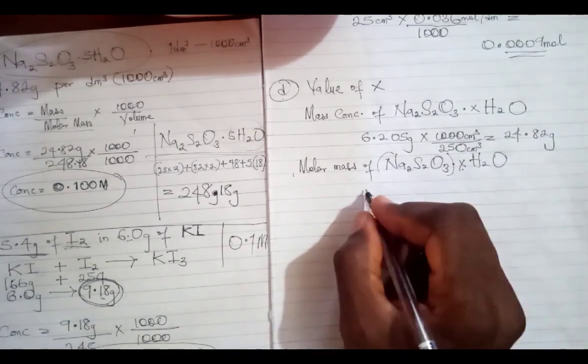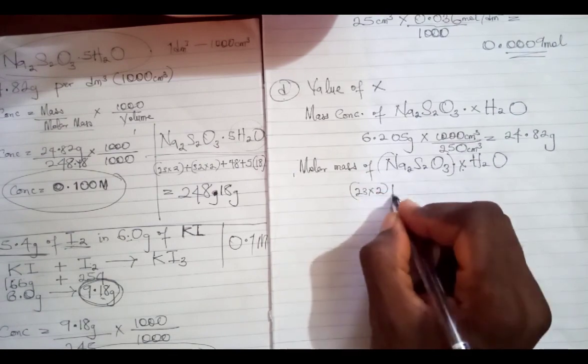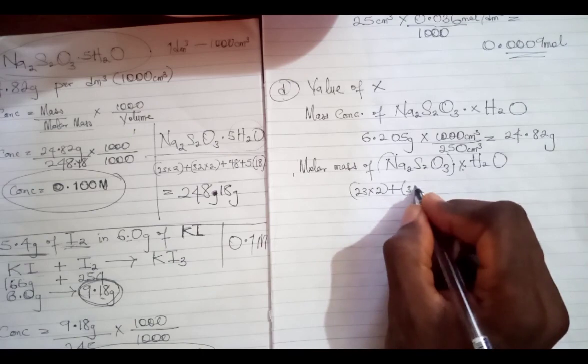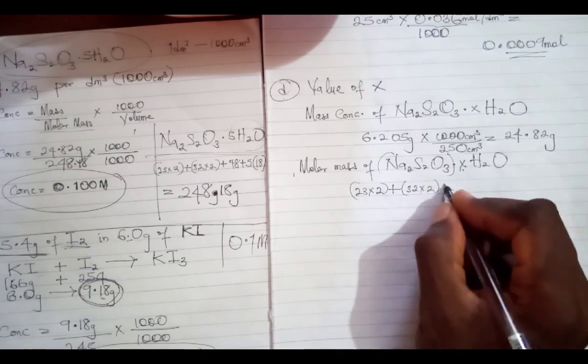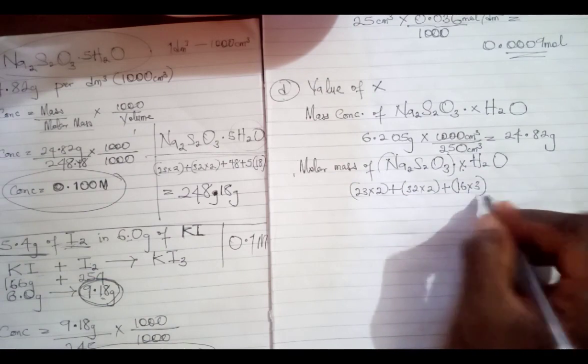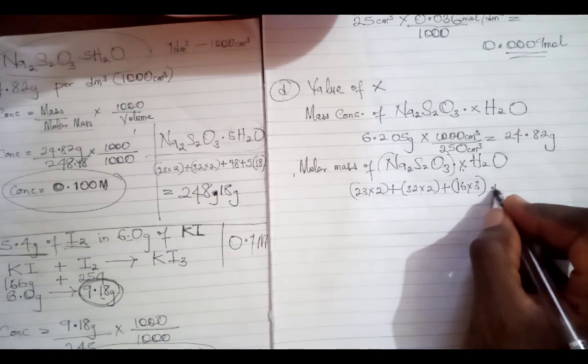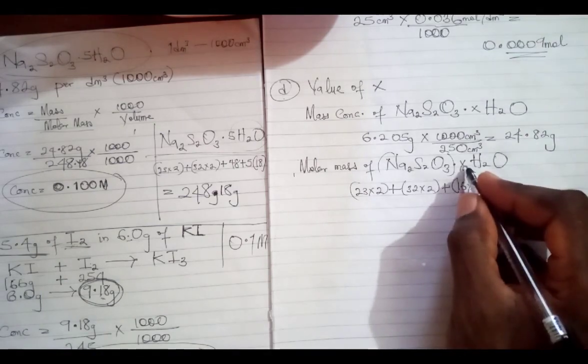Sodium is 23 times 2, plus sulfur is 32 times 2, plus oxygen is 16 times 3, okay, plus water is unknown here.